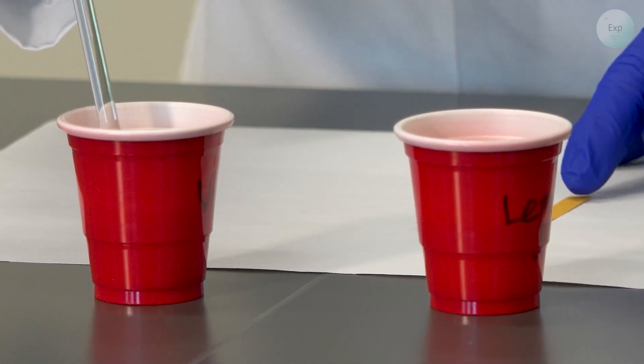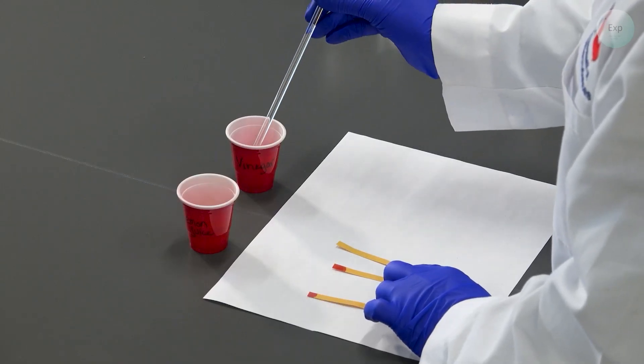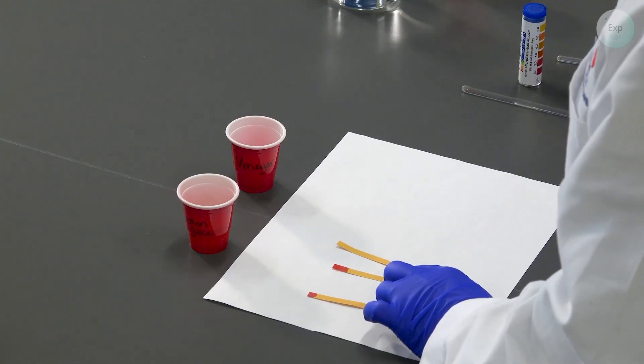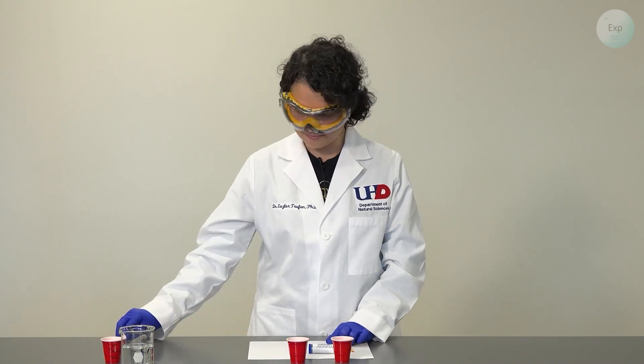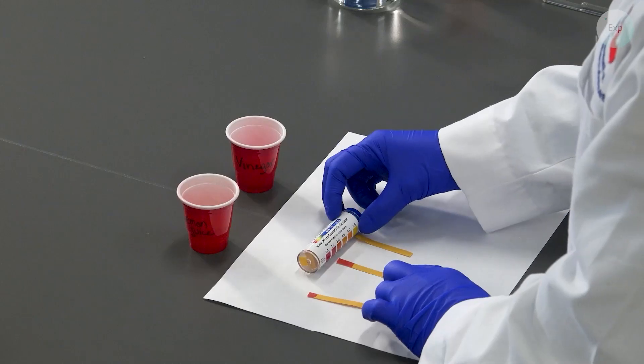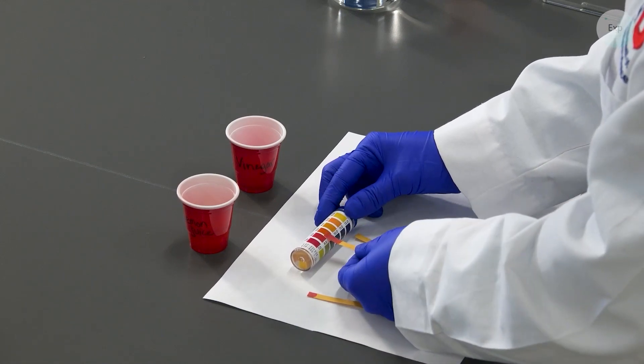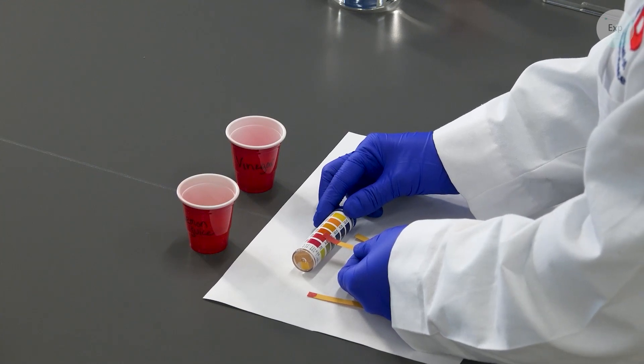So I will dip my stirring rod into the vinegar, place it on the pH paper, and it gives me a color response. I will compare that color response to the scale that is indicated on the pH chart and it appears to be closer to three but somewhere between a pH of two and three.